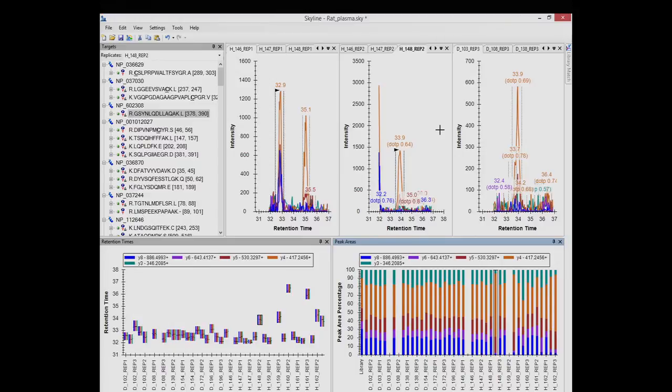We are actually, there's somebody in my lab working on a feature which is apply to all. And that's a good point. We should make it work for peak removal too.